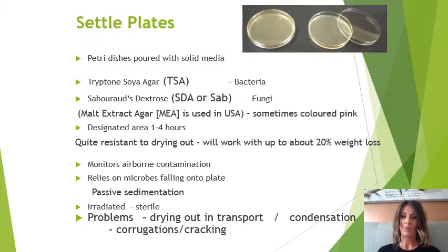There are issues with condensation on the plates, or cracking and damage to the plates, which is why there is a specific way of storing your agar: agar face up and your lid at the base. If there's any condensation on your lid and that is contaminated, that condensation can run onto your plate and cause a false positive result. If you notice condensation on your plates, you should always check with your QA lead or your production manager to make sure that the product's okay and safe to use.